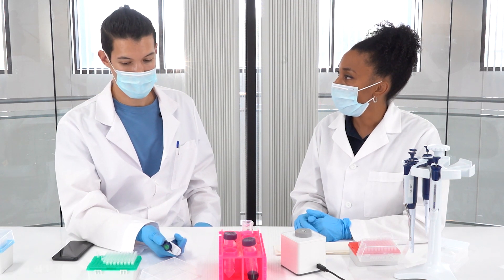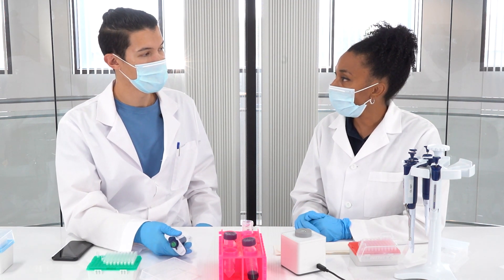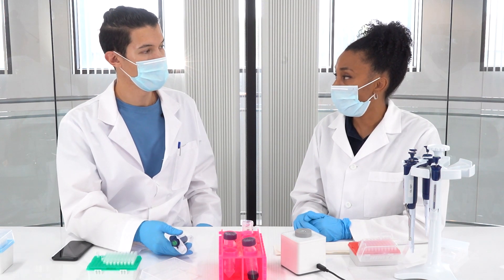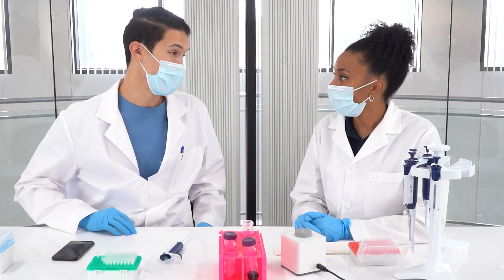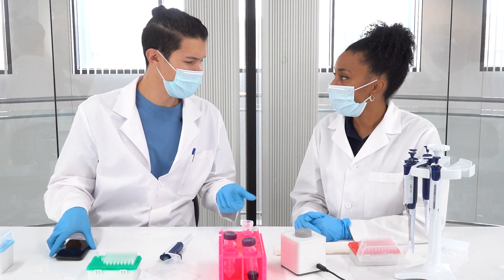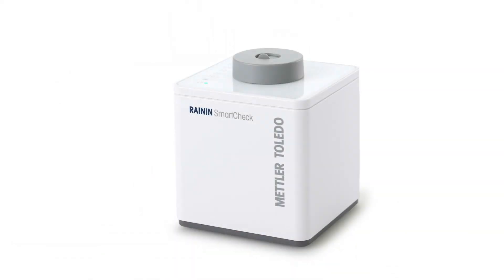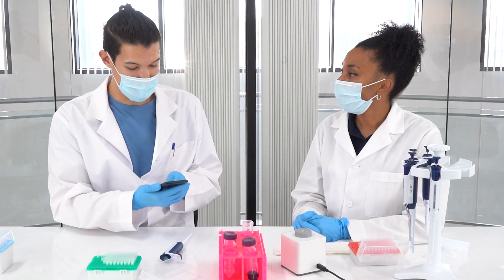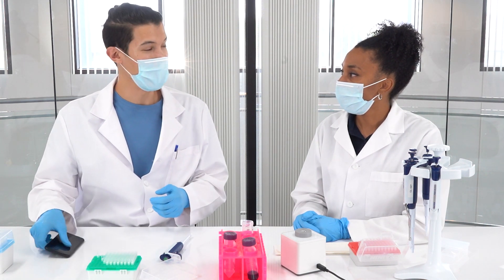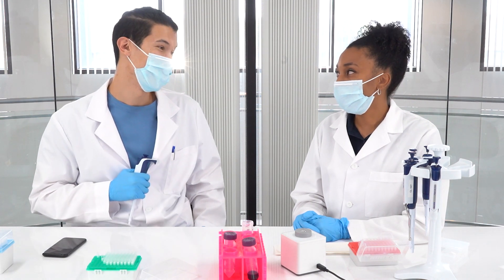You'll see that you're improving over time, and you can also see if you're failing consistently at a certain range — meaning you may need a different pipette for that volume. The device is called the Rainin Smart Check by Mettler Toledo, with PipetteX software. My lab manager is going to sign off on this — next time you see me, I'll be accurately pipetting at 20. I'll hold you to that!